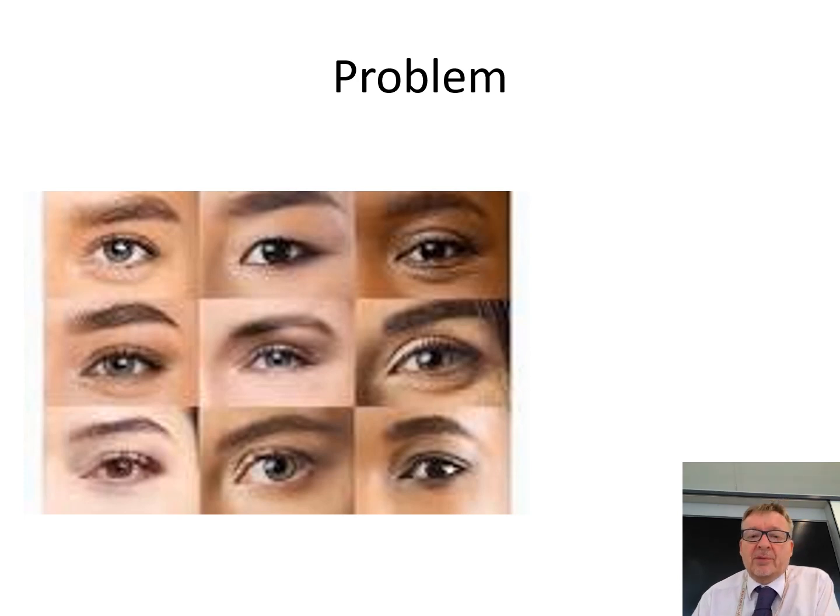Now, the biggest problem with the entire experiment is the person looking at the cross. Because what you do is you look down the cross, and even when it gets to the more concentrated sodium thiosulfates, you don't quite know when it's disappeared. So it always has to be the same person doing the experiment itself, just to make sure that you get your timing right, so you know when the cross has disappeared. Okay, so that's the biggest problem, right? And the one that solves it is the fact that it's the same person each time. Okay, so that is then the disappearing cross practical, right?